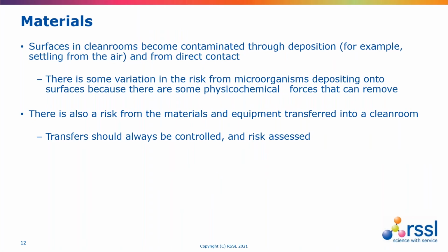With materials, the surfaces within the clean room can become contaminated through deposition, for example, from the air, or from direct contact. And there is some variation in the risk from microorganisms depositing onto surfaces because there are different physicochemical forces that can either attract or aid the removal of microorganisms from surfaces.